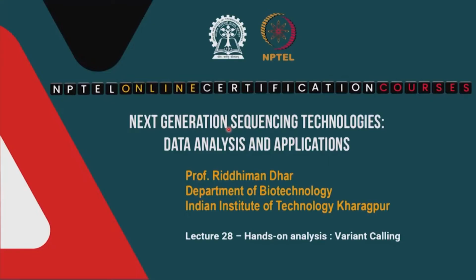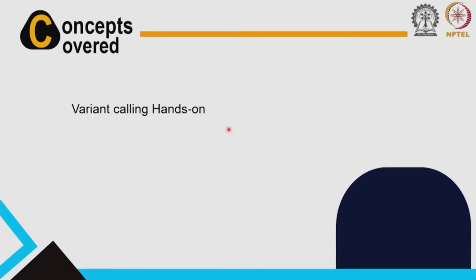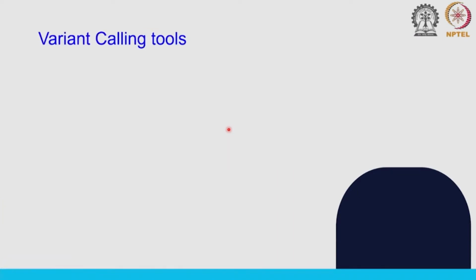In this class, the focus will be on doing the hands on analysis. We will utilize a tool to actually do this analysis ourselves, and we will do some variant calls. This is the topic that we will be covering in this class. So, let us go ahead.